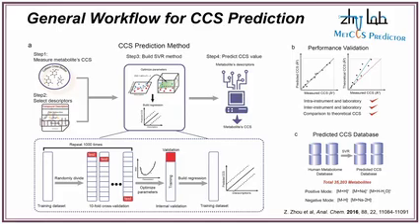And with the growth of the drift tube ion mobility instruments, we do now have a pretty reasonable amount of CCS values for these molecules. And so they could be used to train prediction algorithms that will help us more quickly come up with CCS values for things that we can't necessarily measure directly in the lab.